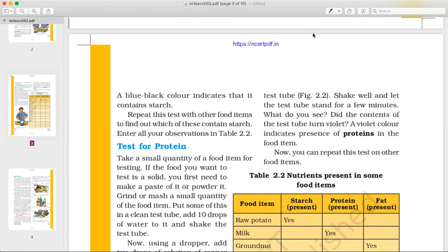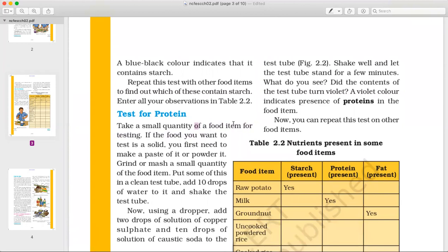Now we will start this video with the test for protein. We need to know if there is protein in a food item, and how do we find out. Take a small quantity of the food item for testing. If it is solid, first make it into a paste or powder, then put some of it in a test tube and add 10 drops of water to it and shake the test tube.